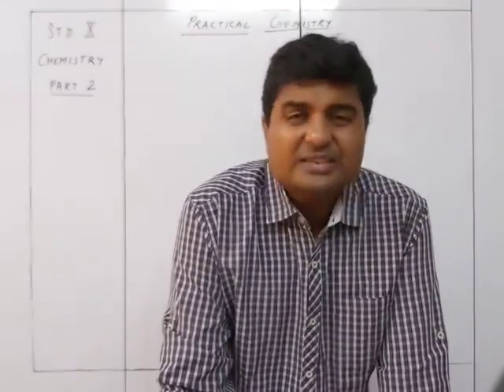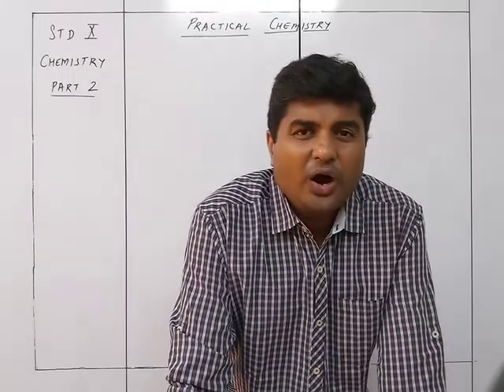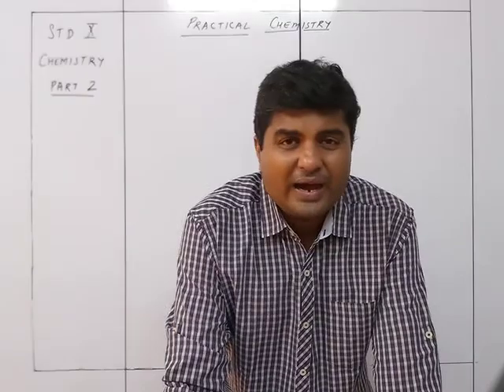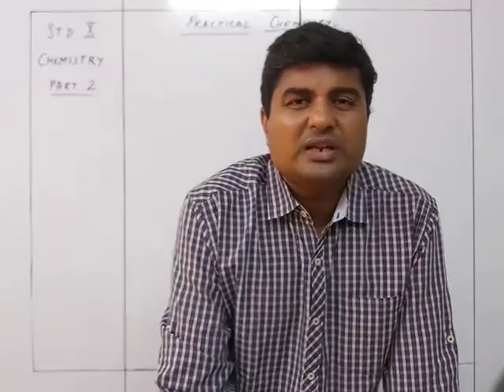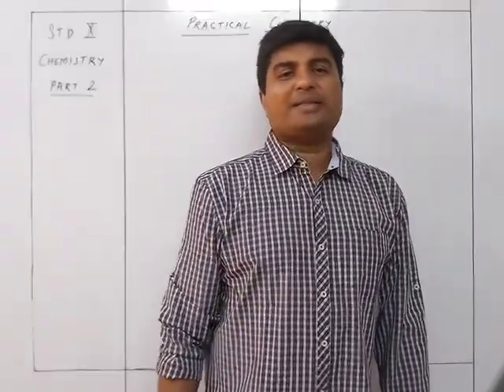Now in this case, each and every color change, or any change in the color of the gas that you see, are the most important observations here. So copper carbonate, originally, is light green in color.